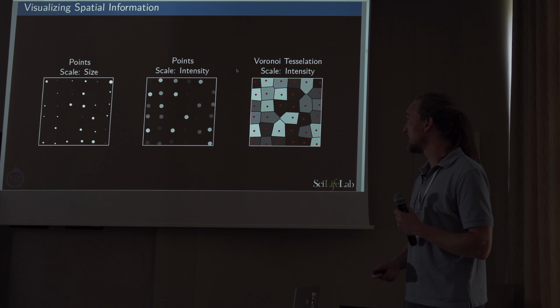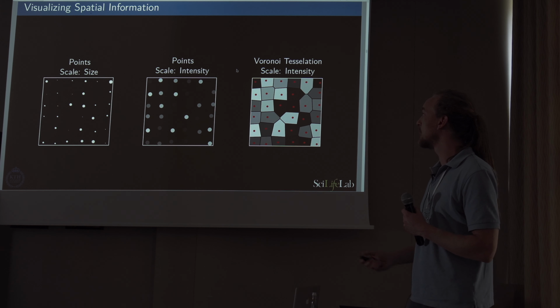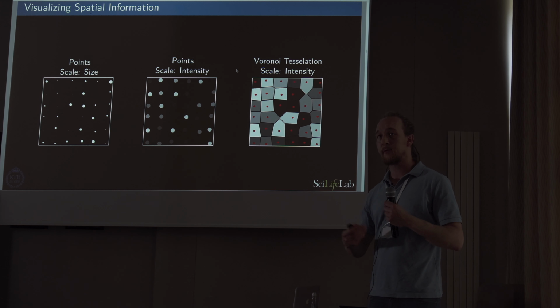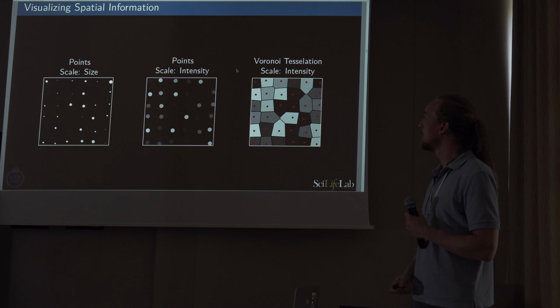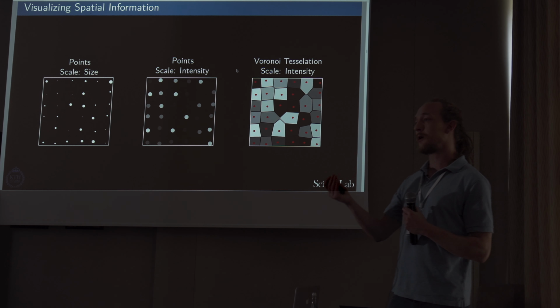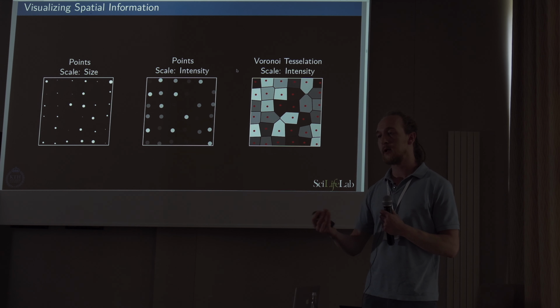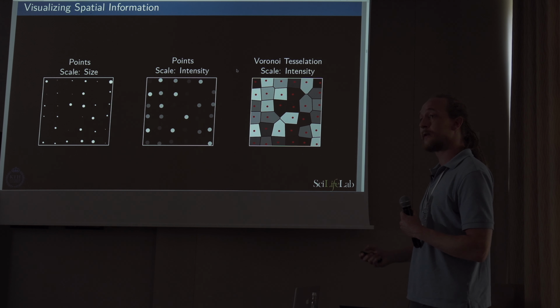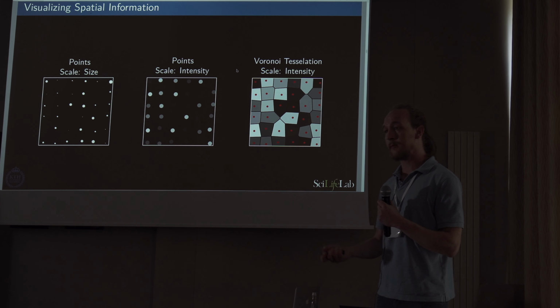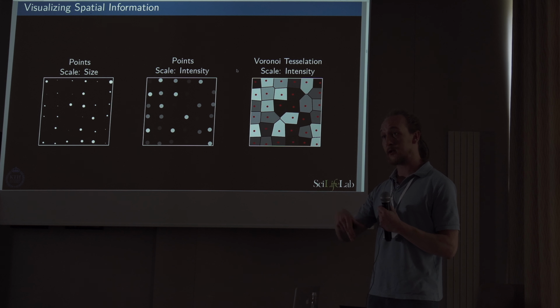Because, for example, if you were to choose point size to indicate expression strength, or you use a simple single channel palette where the background color is identical to low expression, then, for example, missing data will not be obvious or will not be distinguishable from low expression that was actually measured.